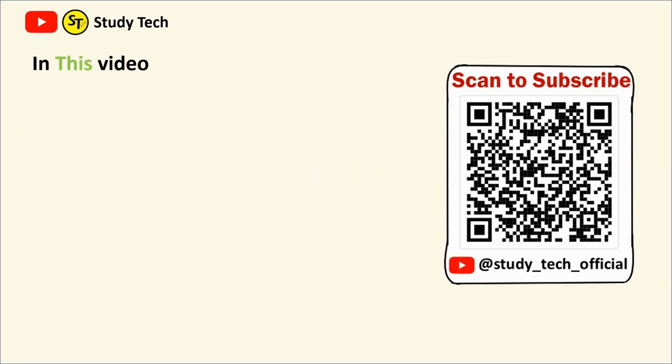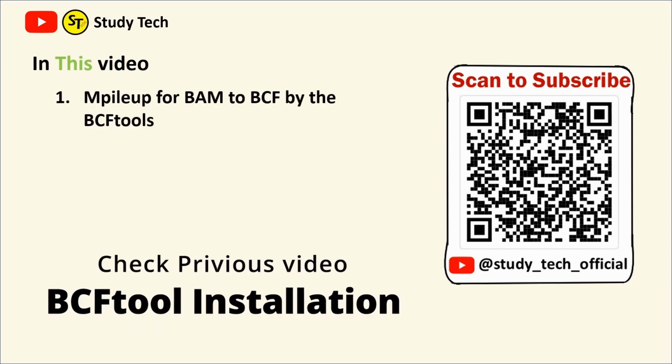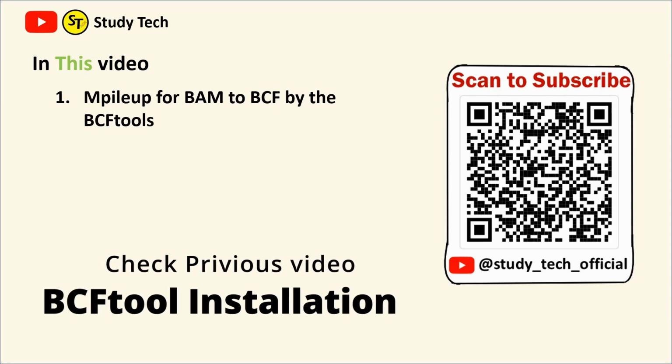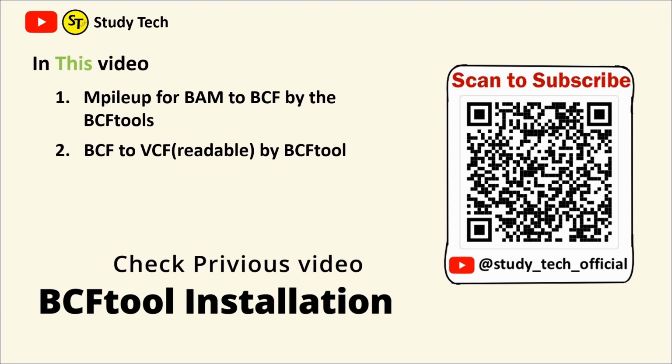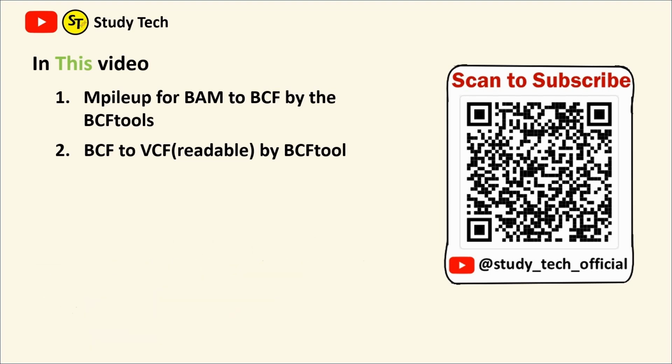Today I will demonstrate how to use mpileup to convert the BAM file into a BCF file by the BCF tool. In the next part, I will demonstrate how to convert the BCF file into the readable VCF file by this same tool.